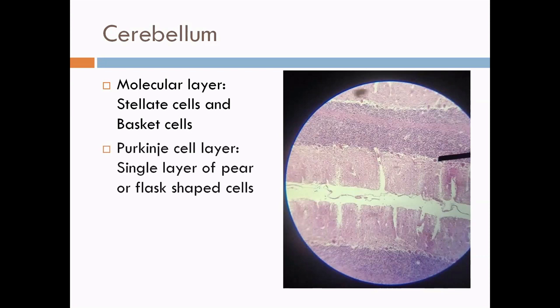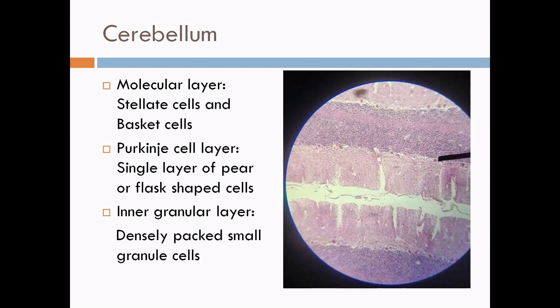The Purkinje cell layer is unique that it is only a single cell thick and it is made up of uniformly spaced Purkinje cells which are pear shaped or flask shaped. Deep to it is the intensely staining granular layer which contains densely packed small granule cells. Golgi cells are also present in this layer.